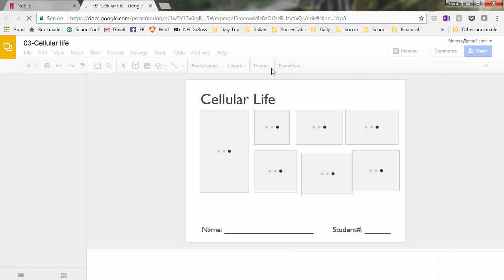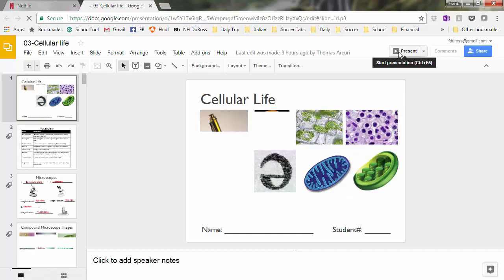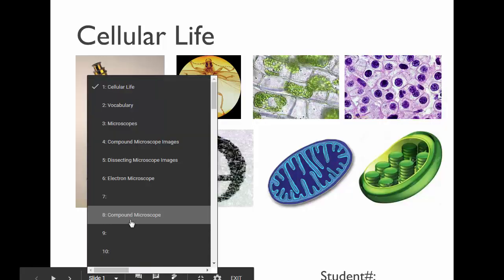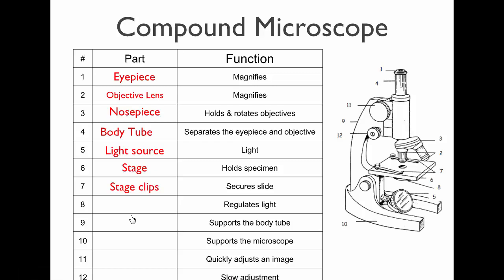And then on the stage there are a couple little metal clips that hold your slide down so it doesn't move around. Those are called the stage clips. So the stage with the stage clips.